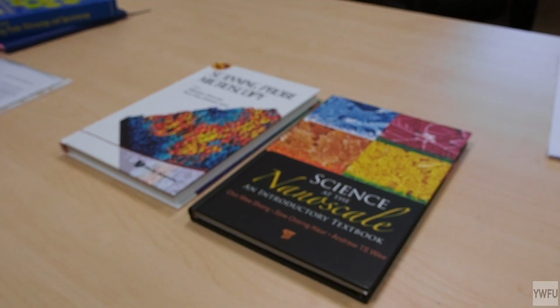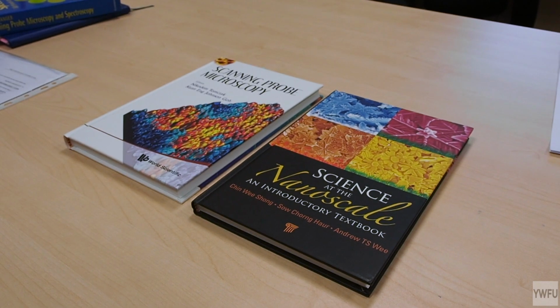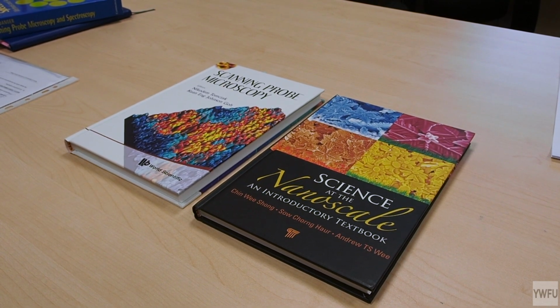But let me tell you something. In fact, we can. So today I'm going to introduce two techniques in my lab that allow us to see things at the nanoscale. I see. What are those techniques? Yeah, okay. The first technique is called Scanning Tunneling Microscopy, STM, and the second is Atomic Force Microscopy.